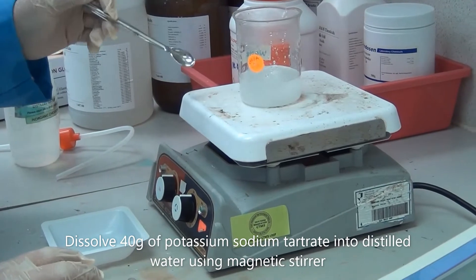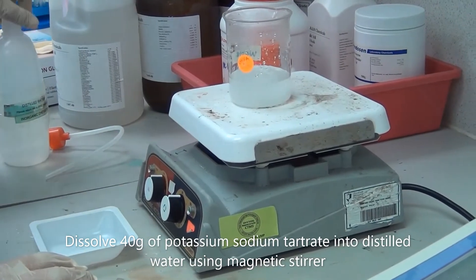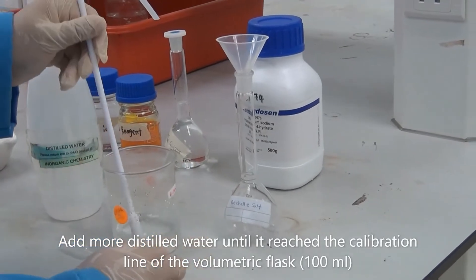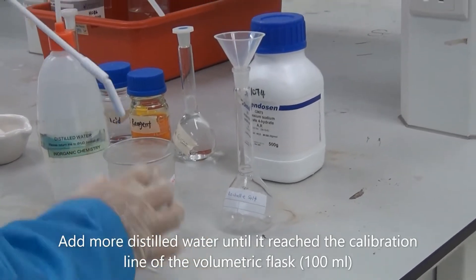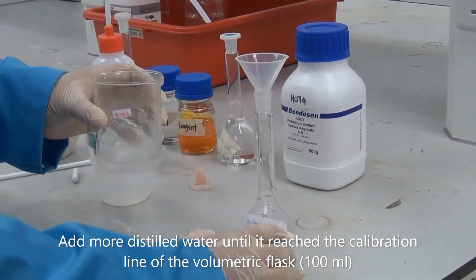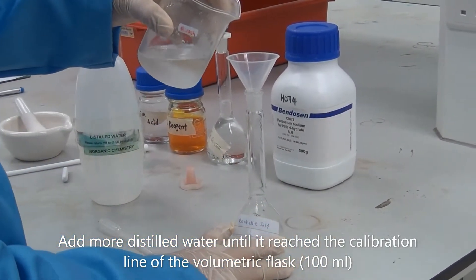We have to wait until all the chemical is off, then we take out the stirrer, and put the solution into the volumetric glass.